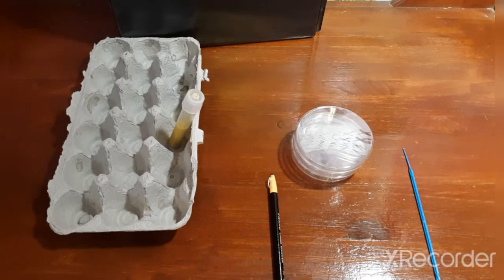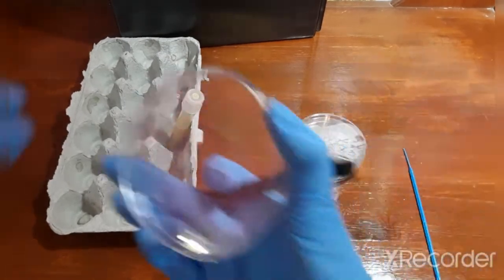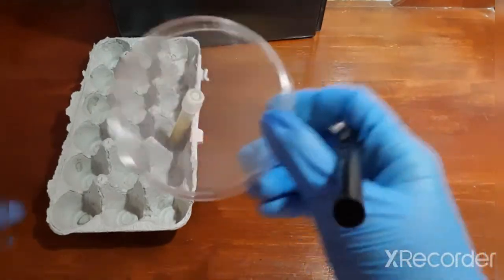Once you've gathered all your materials, label three sterile empty plates with your initials and label them A, B, and C. I don't actually have an agar plate, so I'm going to be using a plastic petri dish instead.